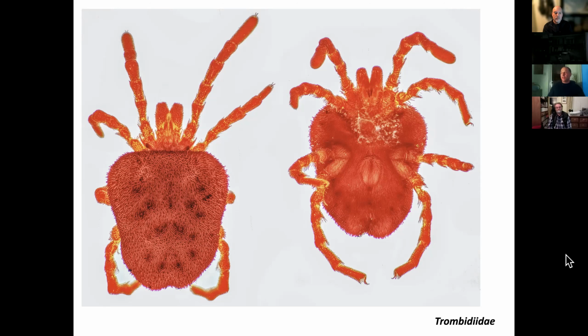And again, this is where top lighting comes in, because if you have a creature like this, it's often very difficult with a compound microscope to see any detail in the features when you've got the light shining from below. Whereas when you have light shining from above, and these are quite big creatures, you may be able to see quite a lot of detail with 100 times magnification. But even at times 40 magnification, you can still see a certain amount of detail.